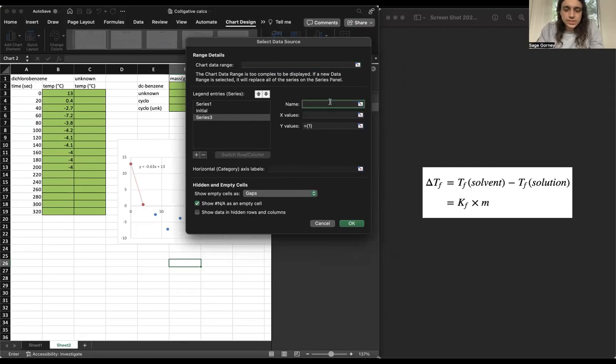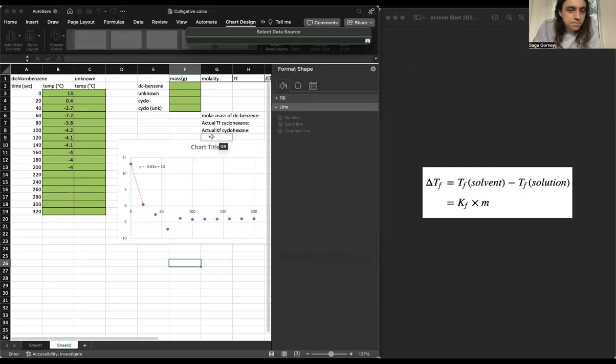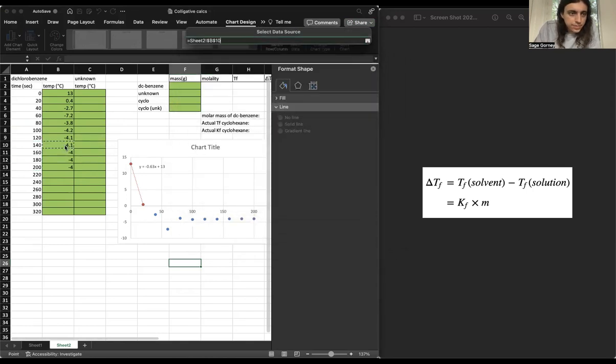Yeah, so we'll name this final. Sure, doesn't matter. No one's going to see it anyway. And so we're picking our last 4 data points. So I'm picking the last 4 points for my time. And we can go back here. That's selected. Now we're picking our Y, the last 4 Y points.